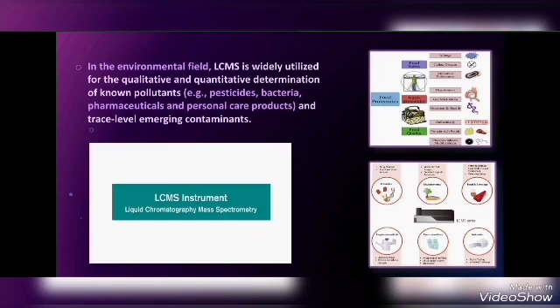LCMS instruments, liquid chromatography mass spectrometry.